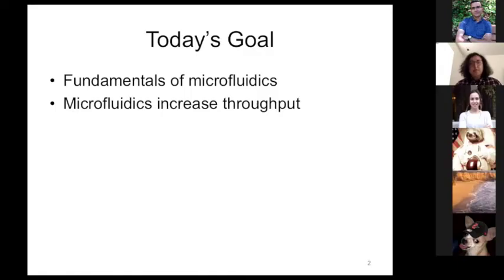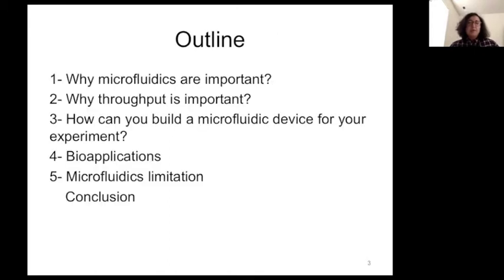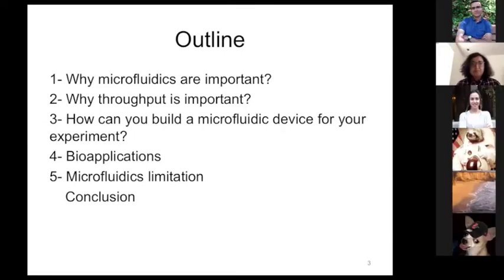Throughput. Okay. So we're going to talk about why microfluidics are important, why throughput is important, and how you can build your own microfluidic device for your own experiments if you want to do research. We're going to talk a little bit about bioapplications in microfluidics and also, at the end, microfluidics limitations.